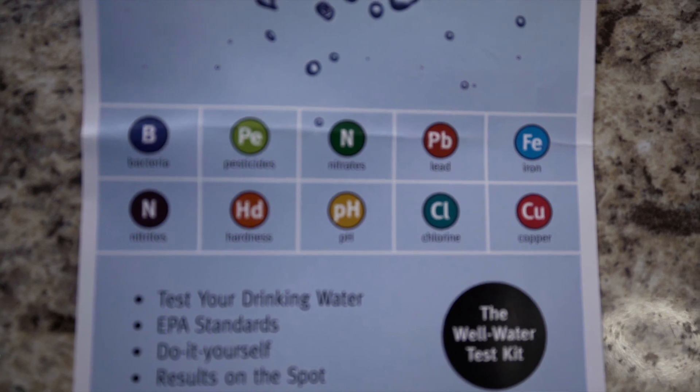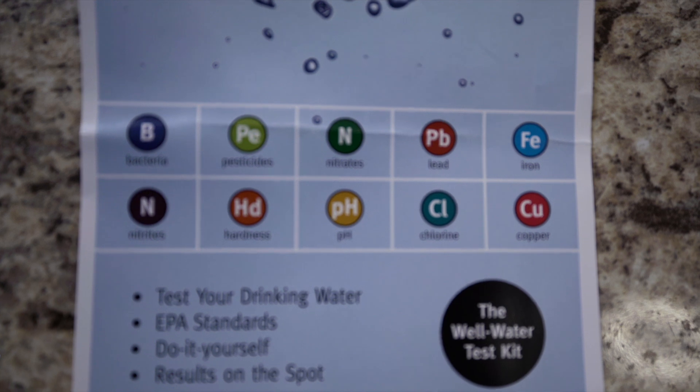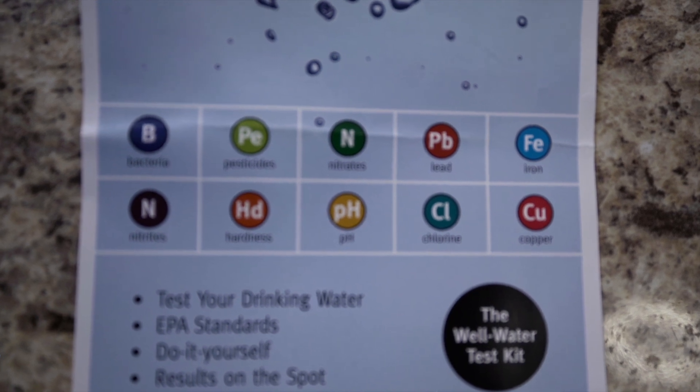This kit tests for coliform bacteria, pesticides, nitrates, lead, iron, nitrites, hardness, pH, chlorine, and copper. I don't really need to worry about chlorine too much, but we do need to worry about herbicides and pesticides because there are a lot of farms in the area and there's a lot of runoff from that.